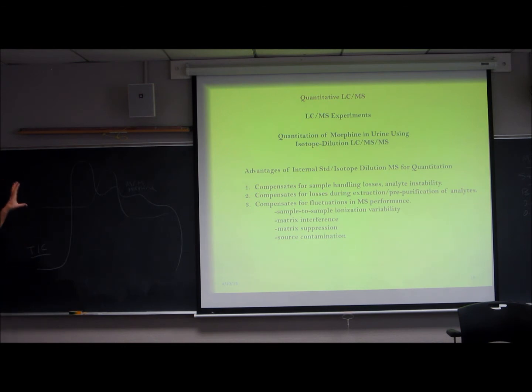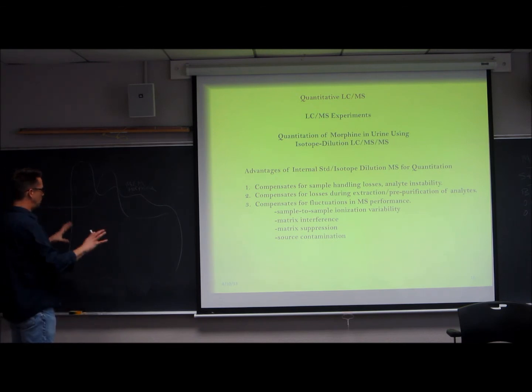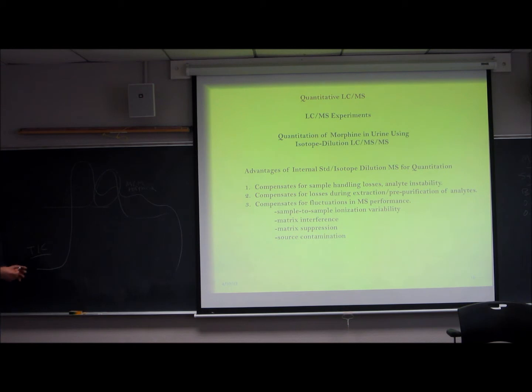In which case, you've got to use the power of chromatography to change your chromatographic conditions, column, mobile phase, to get what you want away from all of the junk. And then boom, your signal comes up through the lack of matrix suppression, and you have a nice quantitative method.